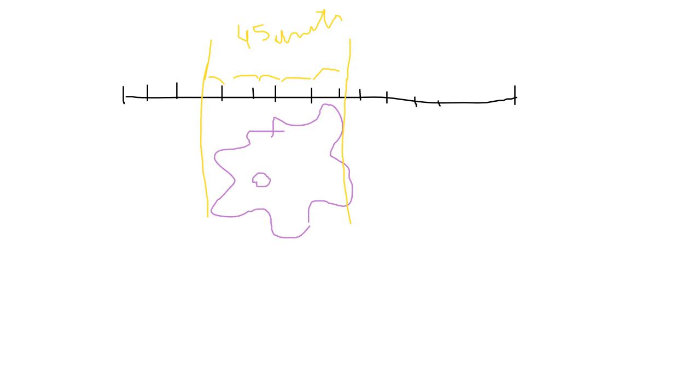And then I ask you, how large, and type this. This is the type of question I'll ask you in homework, I'll ask you in exam. How large is the amoeba? Put it on the chat.